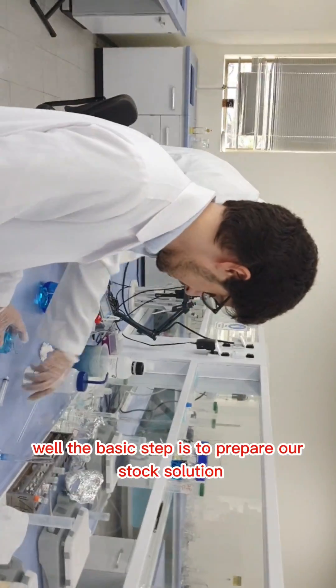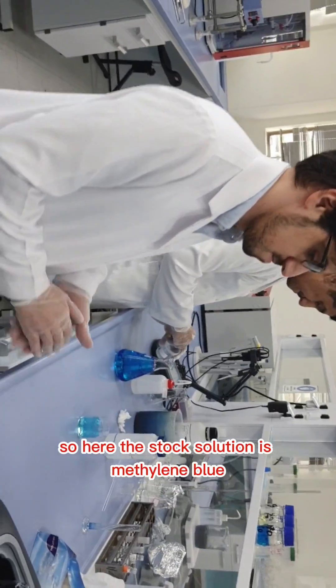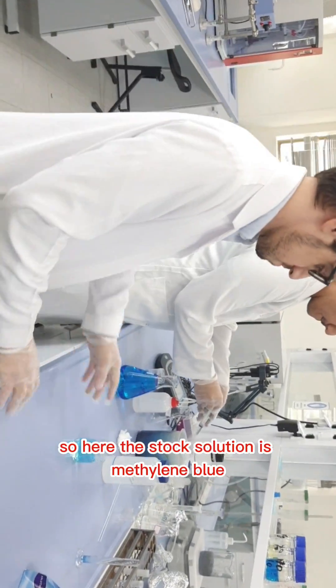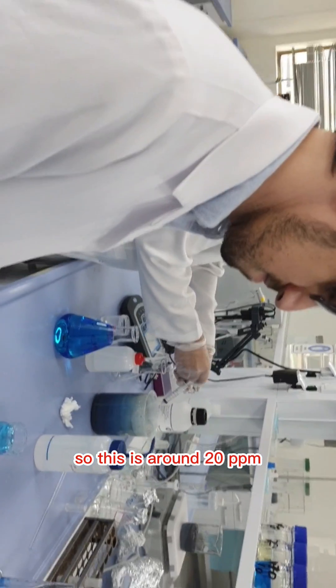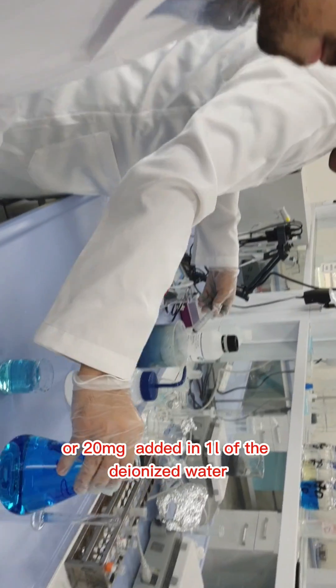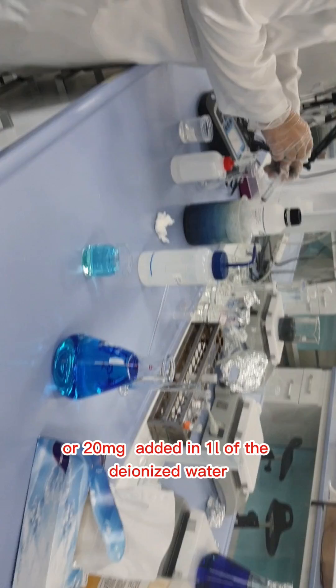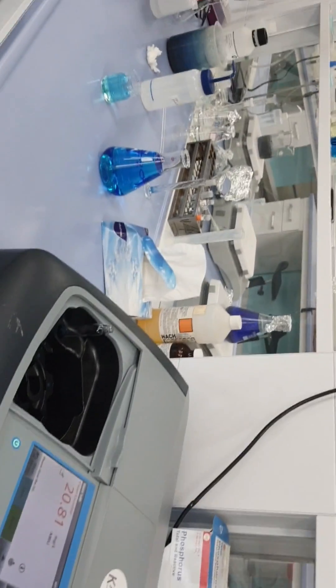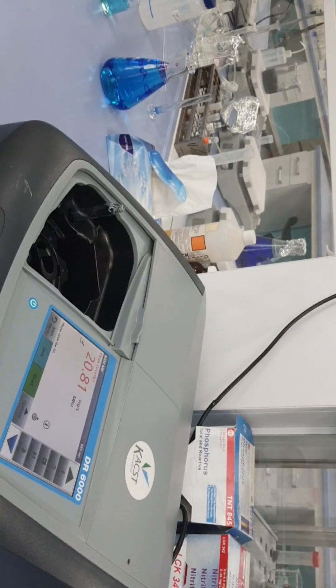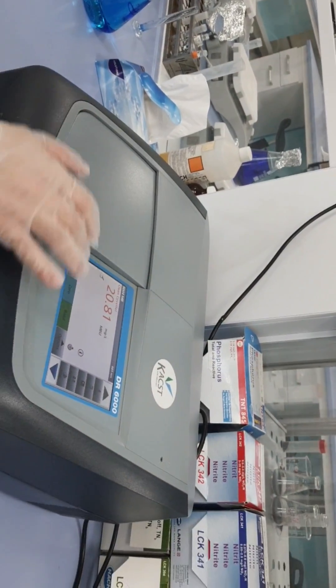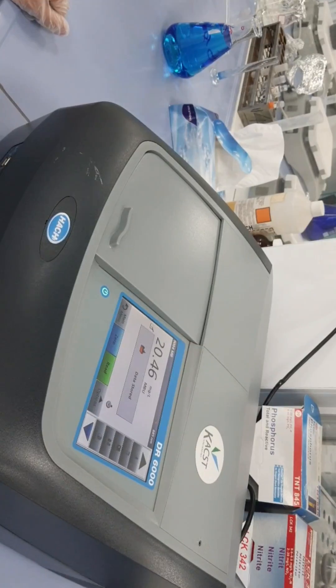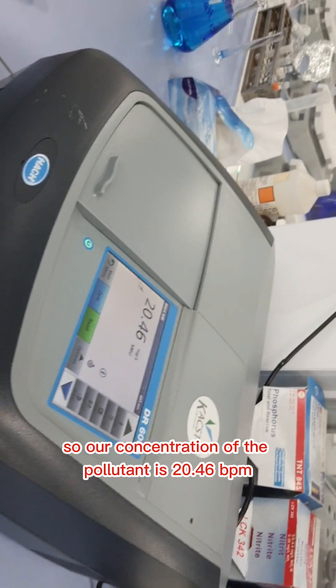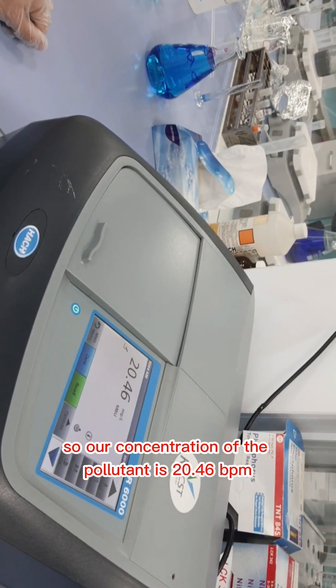The basic step is to prepare our stock solution. The stock solution is methylene blue, around 20 ppm or 20 mg added in 1 liter of deionized water. The next step is to measure the pollutant concentration. Our concentration of the pollutant is 20.46 ppm.